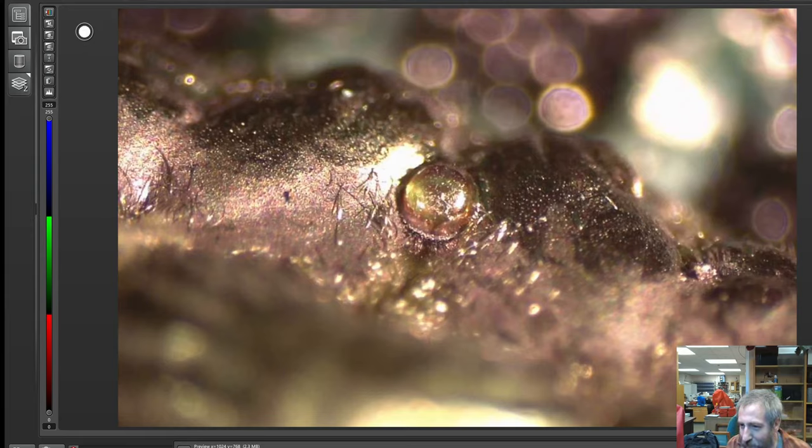The eyes between its eyes. Yes. Lizards have three eyes. You mean lizards have three eyes because one of them's a sensor eye that's on their head, and then they have their regular eyes that they use for seeing? Because technically insects have thousands of eyes, but they have one pair of compound eyes on the outside edges, right? And then they have these little tiny ones that are in the center of their heads.